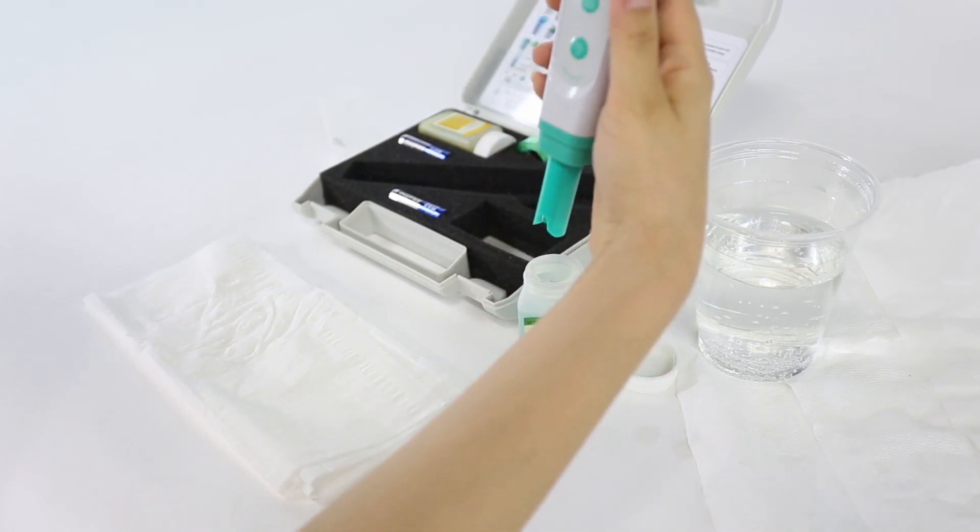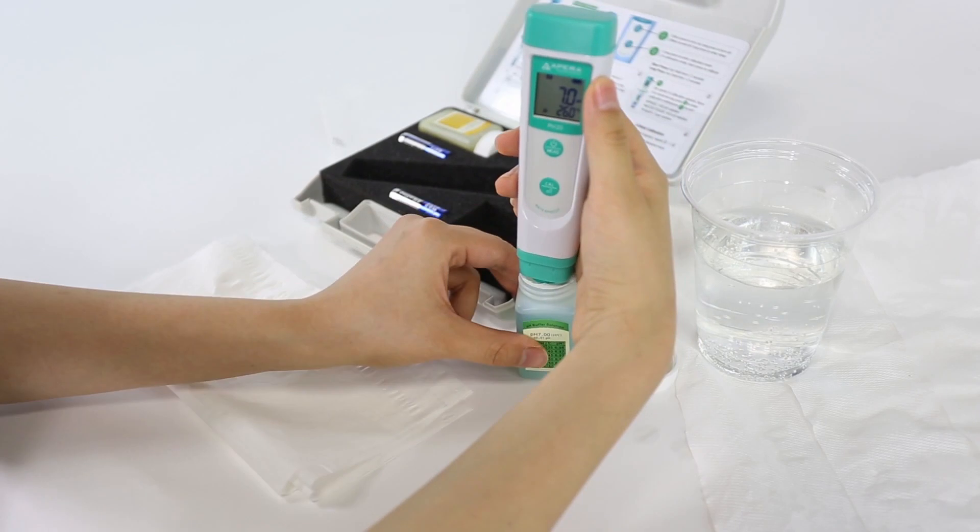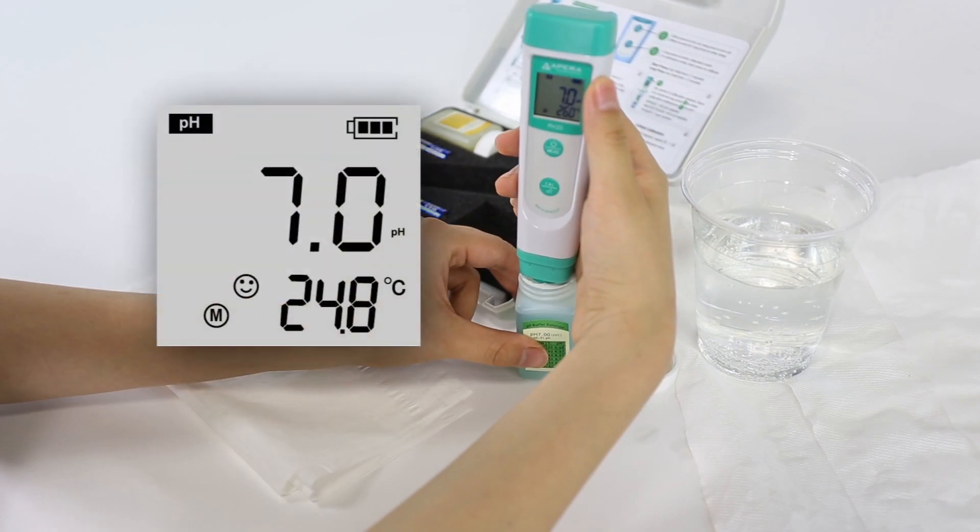Dip the probe in 7.00 calibration solution. If the reading is just 7.0, that means the probe is accurate and calibration is not necessary. If the reading is not 7.0, you will need to calibrate the probe.